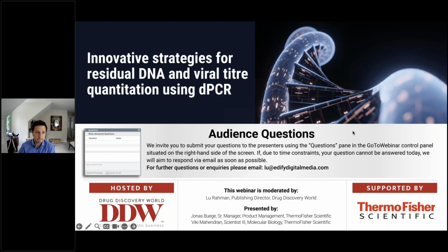Okay, lovely. Thank you for that. The next question is, what are the gene targets of your residual DNA? Is this only for HEK293? And what about kanamycin resistance or ORI? I think there are probably two questions. Let me answer the first one, right? For the HEK293 kit, I can't specifically share what we are targeting in our assays, but I can share that it's multiple highly repetitive elements that are across all the chromosomes, for multiple reasons, primarily to achieve the sensitivity that we are achieving.